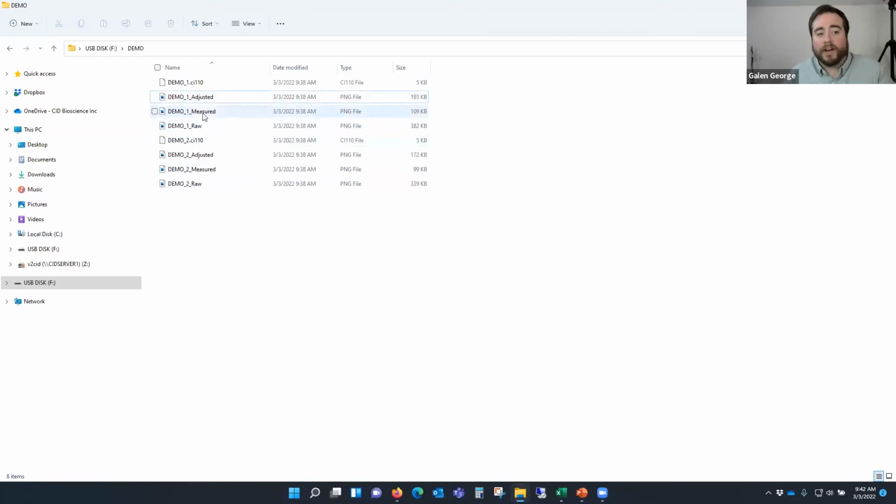So I took those measurements, but I did not actually do any analysis on them. If I were to actually save those measurements, it would have saved a CSV file for each of these as well. And that CSV will contain all the information as far as the calculations.